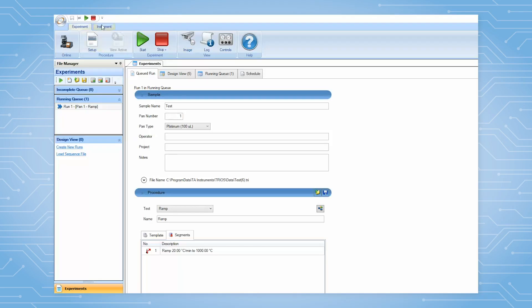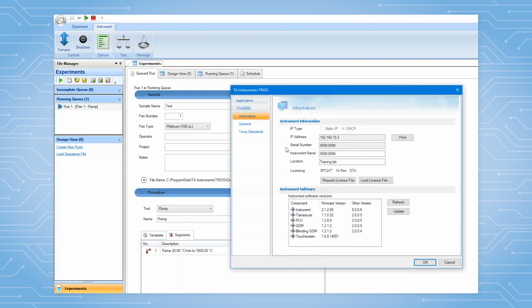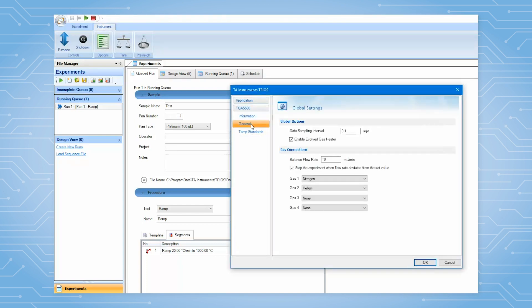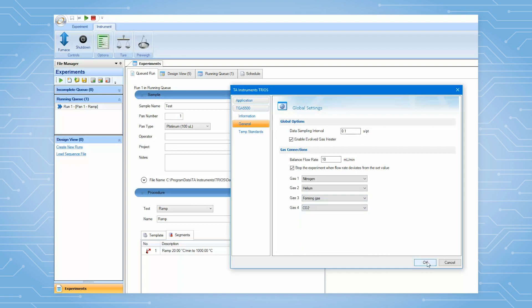Next, in the TRIO software, go to Options, then General, and select the gases you will be working with on each of the ports. You will see a display list for gas 3 and gas 4 of the recommended gases to use when working with the Blending GDM.